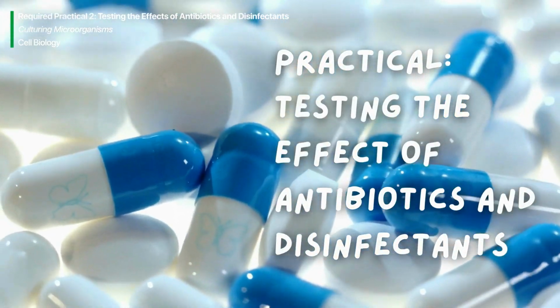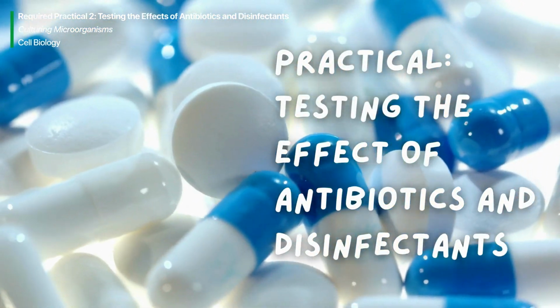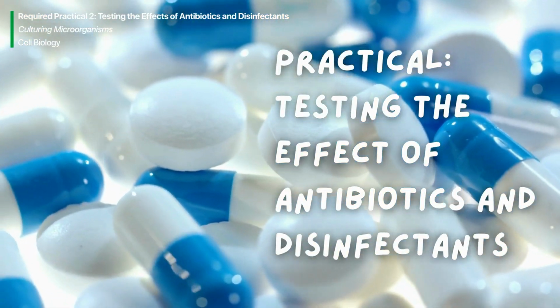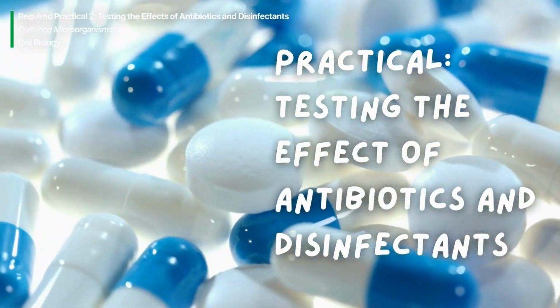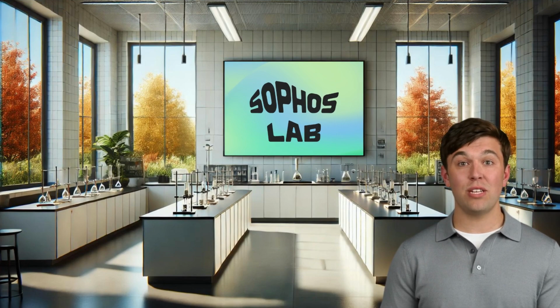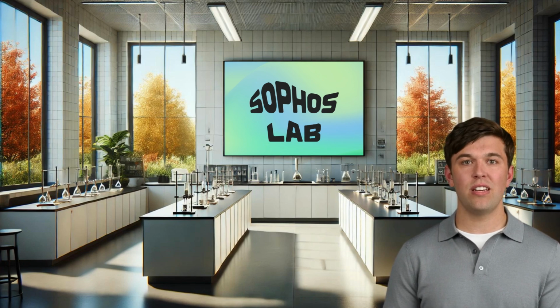Hello and welcome to today's lesson on testing the effects of antibiotics and disinfectants, where we will conduct a practical experiment to learn more about culturing microorganisms. We're about to head into our lab to explore a fascinating experiment that directly ties into the concepts we've been covering. But first, over to Sam, our lab technician, to outline what safety equipment we need.